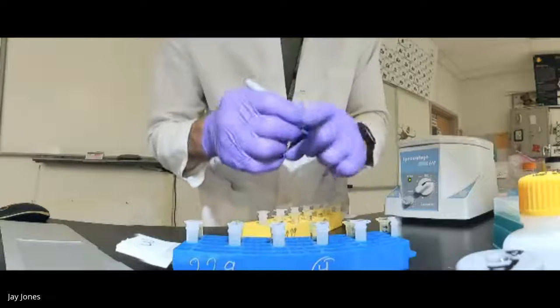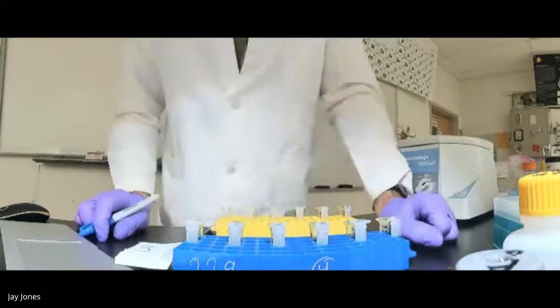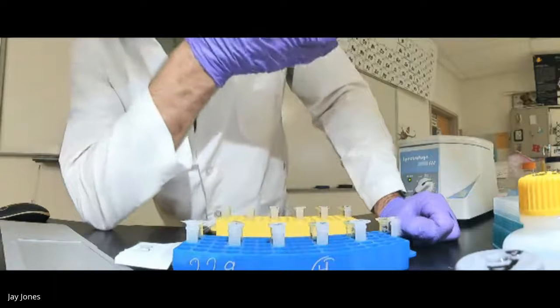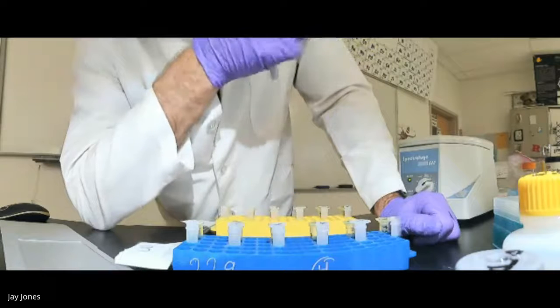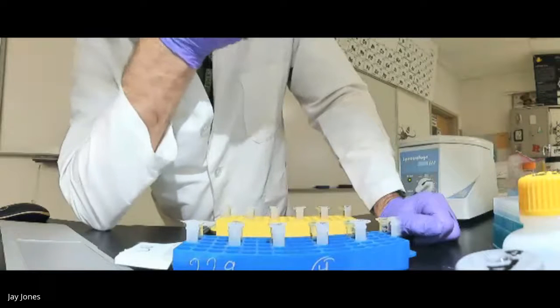So usually it's made in recombinant bacteria, and then they purify it from recombinant bacteria, kind of like what we're doing with DNA. You can buy it, but then just don't say I'm going to put it in my cell. Tell me how you'd get it in your cell, because you still have to get the glutaredoxin into your cells. Right. And you could electroporate if you want. Okay. I said inject. Yeah, okay. I'll take it.